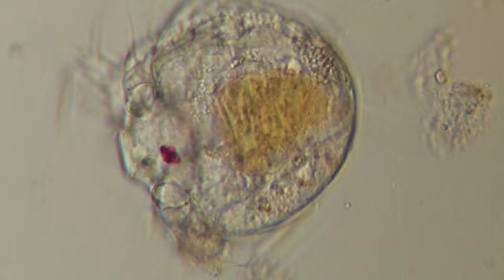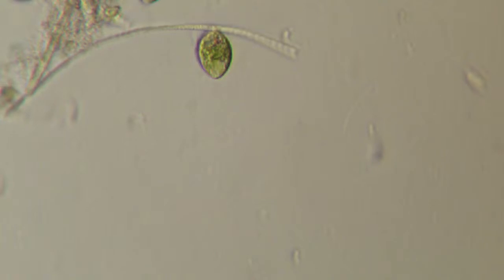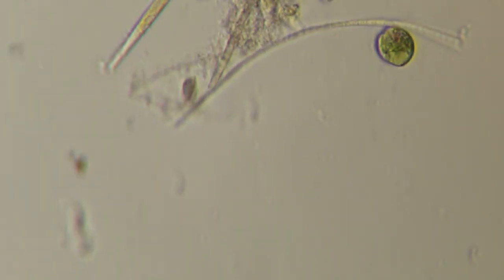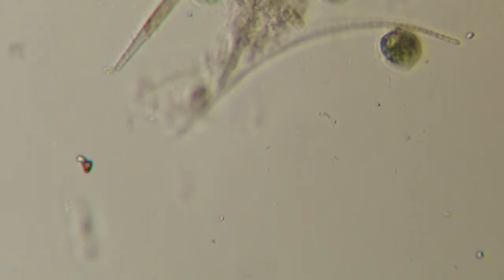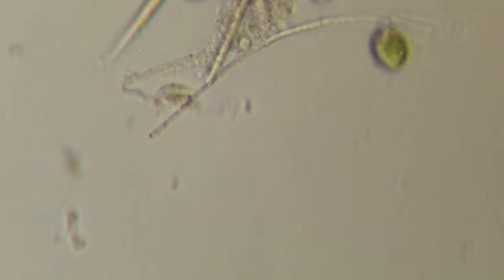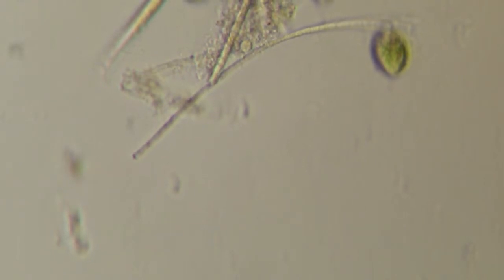Anyway, so that's the larva doing its thing. Nice filamentous algae there, moving. Colonial algae, it's probably a cyanobacterium. It's more related to bacteria than it is to plants. Blue-green algae, making these long colorless threads.